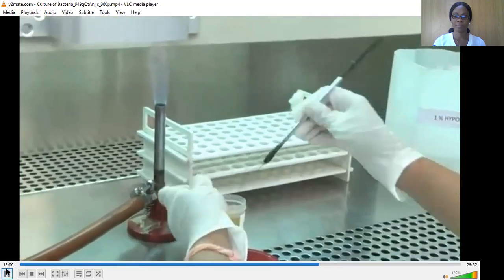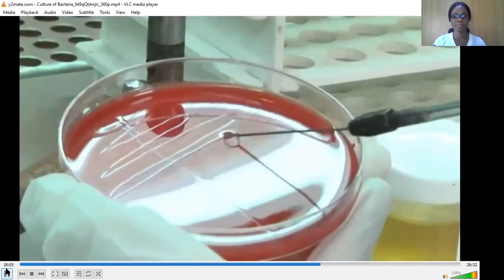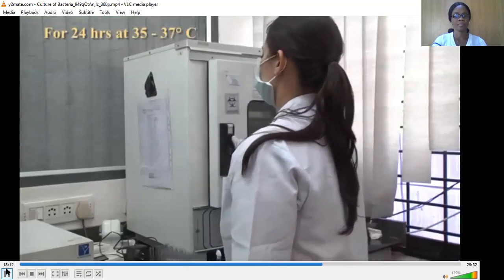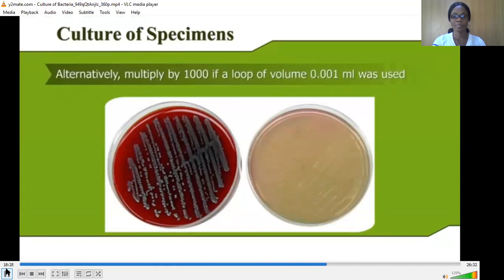Without reflaming, insert the loop vertically into the urine container again and repeat the procedure for the other plate. Incubate plates for 24 hours at 35 to 37 degrees centigrade. Colony forming units, or CFUs, are counted on each plate and are multiplied by 100 to determine the number of microorganisms per milliliter of urine. Alternatively, multiply by 1000 if a loop of 0.001 milliliters is used.